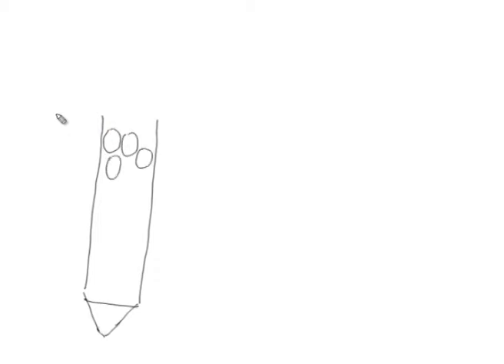Now, what is the property of the bead, like what is the basis of separation here? These beads are porous beads, these are hollow beads actually, and if I draw a single bead here, it is totally hollow inside and has a particular pore. This is just a schematic. These are cross linked polymers and they present a gel like structure and they have a particular porosity because of this cross linking.